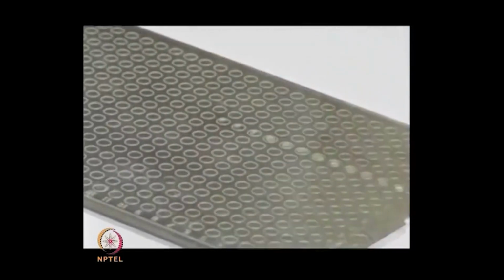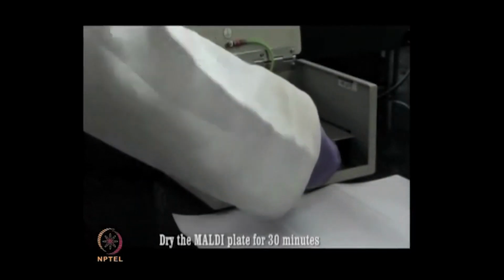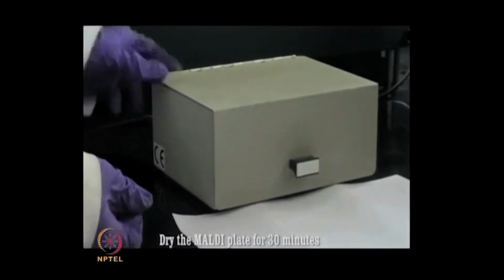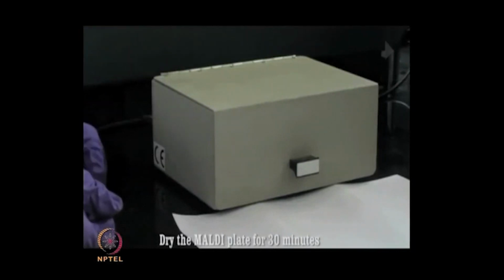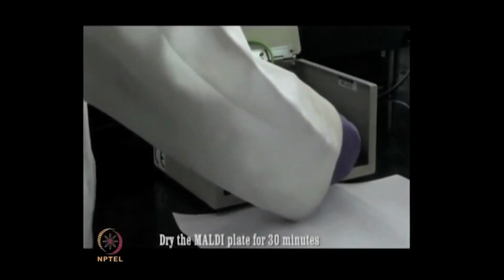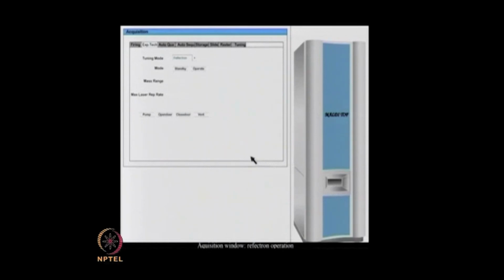Once completed on the MALDI plates, the samples are allowed to dry for 30 minutes, after which the instrument is switched on and MS analysis can be performed. While these steps are happening, you need to ensure that the instrument is on.